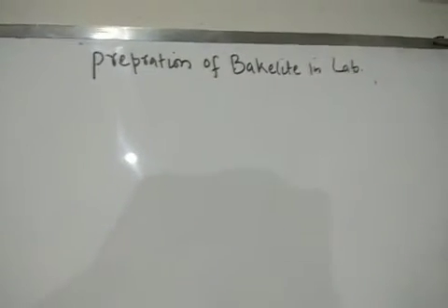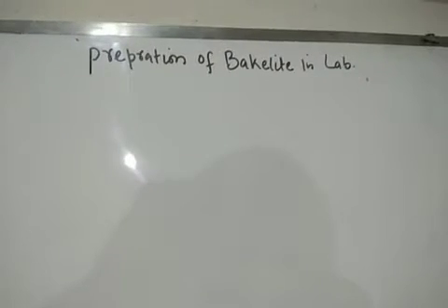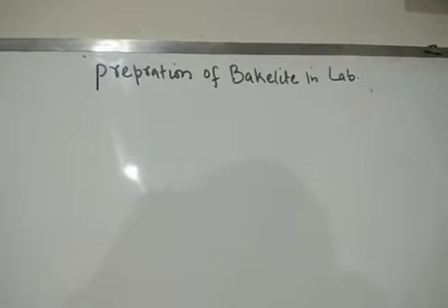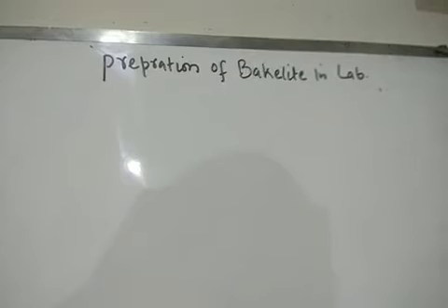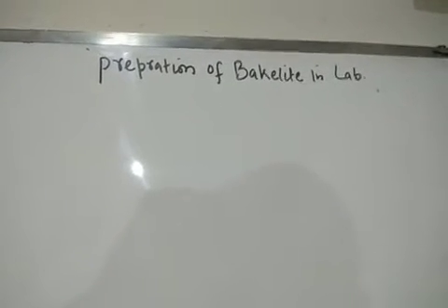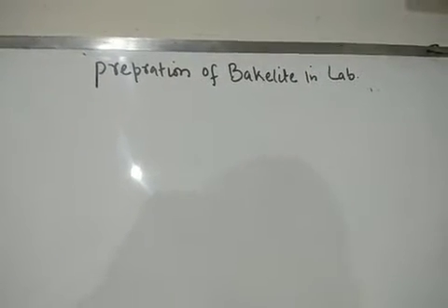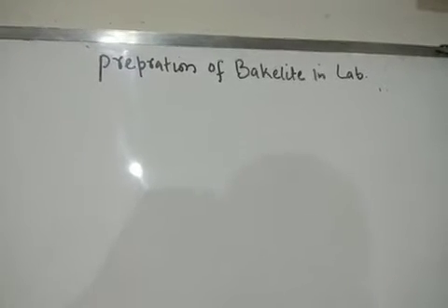Bismillahirrahmanirrahim. So today we will discuss the basic steps, the main steps involved in the preparation of bakelite in the lab. Any UG or PG, undergraduate or postgraduate lab, or common labs available, usme kaise aap bade easy andaaz mein ek bakelite bana sakte hain.